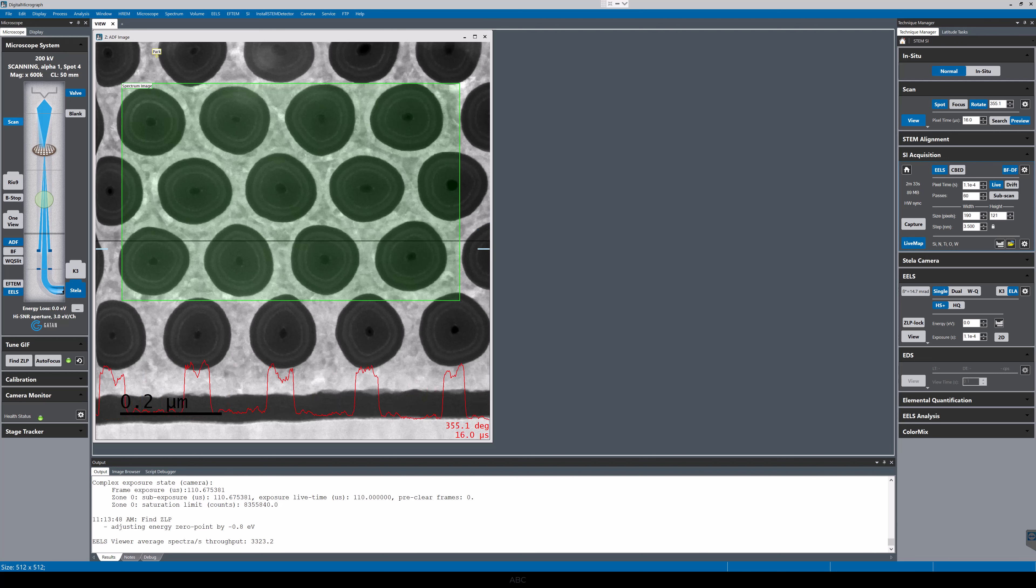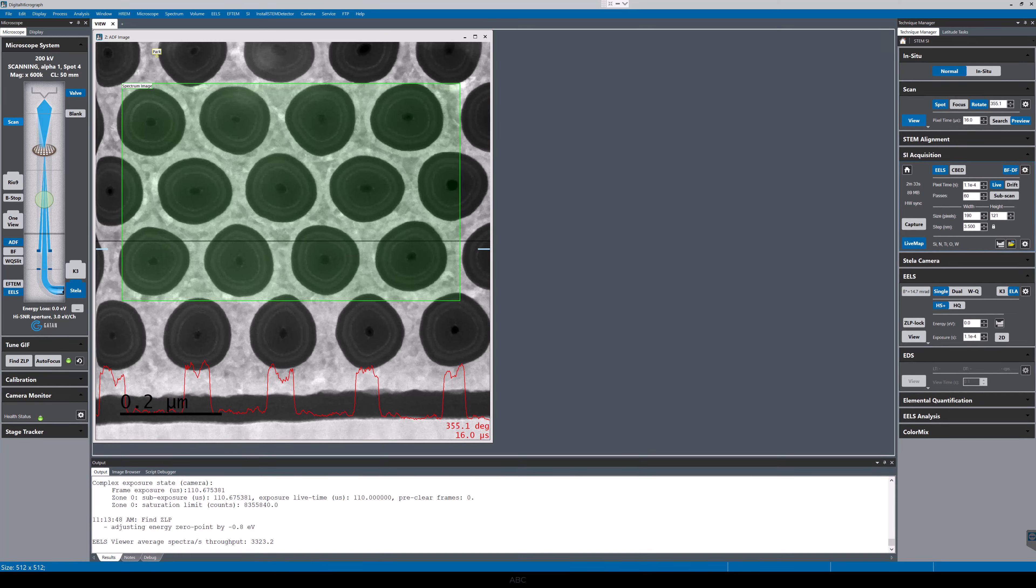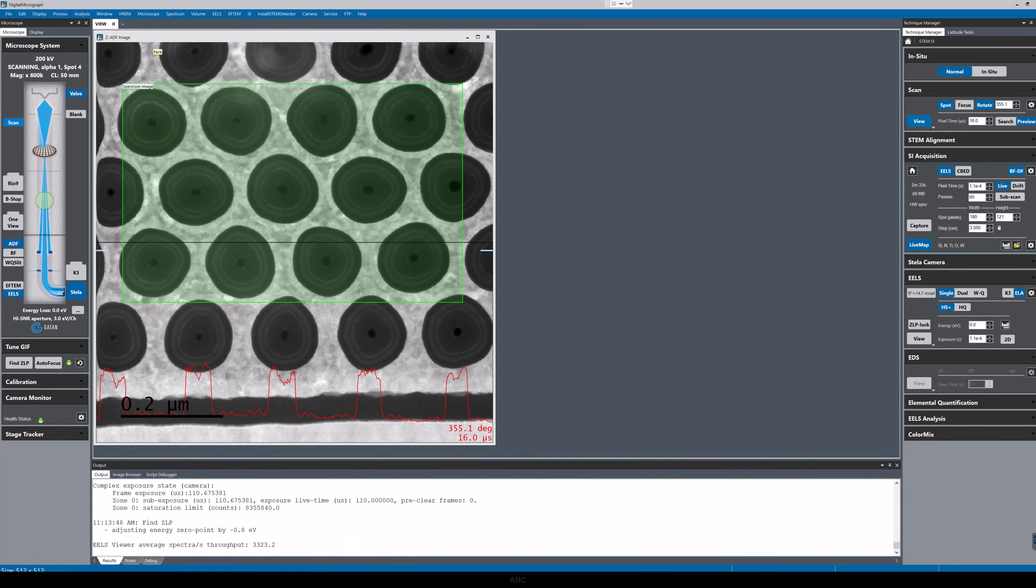We're going to be looking at how to use the GIF Continuum and DigiScan3 to acquire EELS spectrum imaging data using the new Continuous Scanning mode and Continuous Drift Correction.